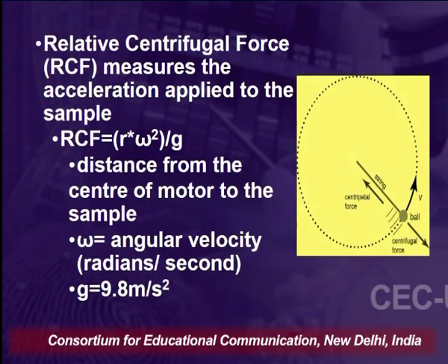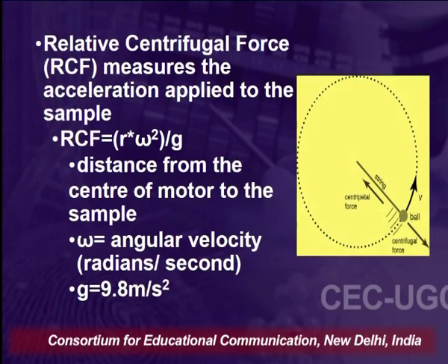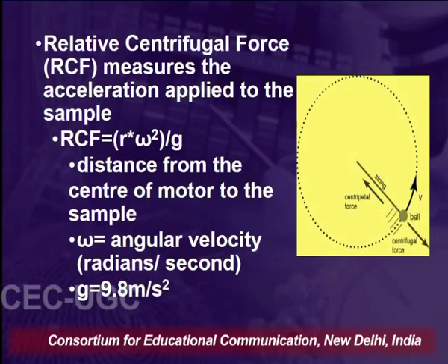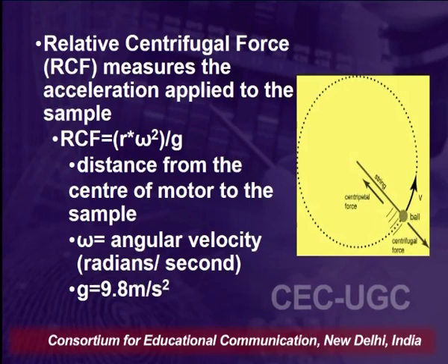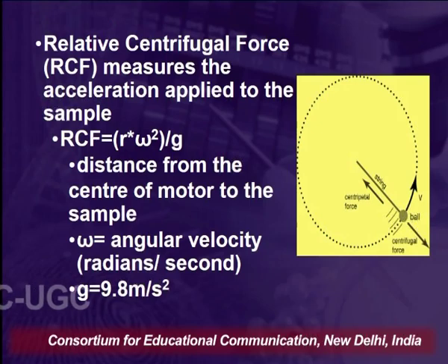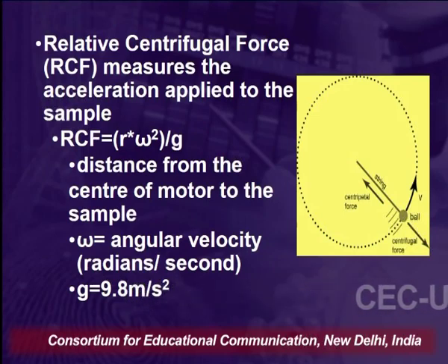Depending upon different types of materials, they require different speed, different centrifugal force to get separated. Take the example of the extraction of DNA step by step. At different points, we have to break the wall of WBCs, or break the wall of the nucleus, or separate the other material out of that.